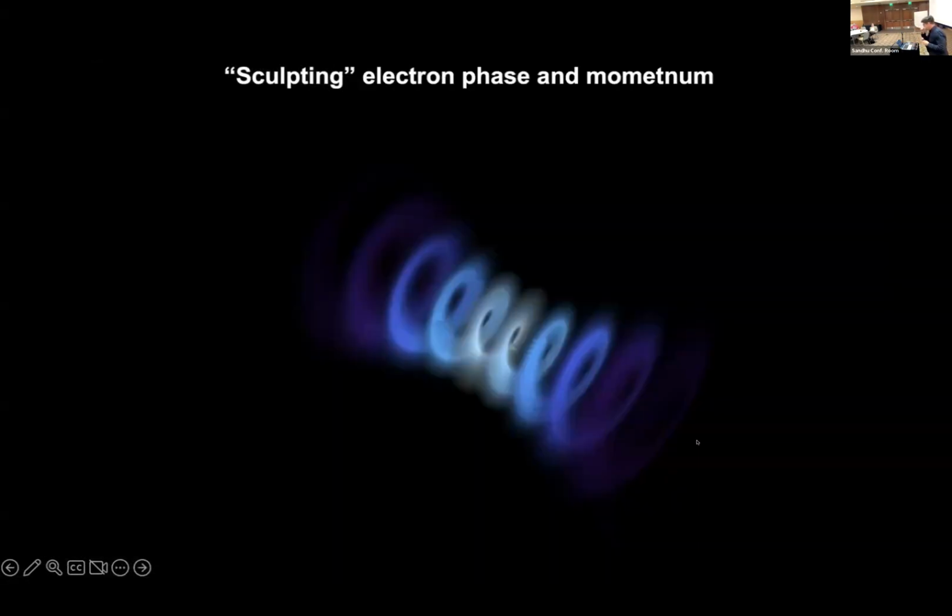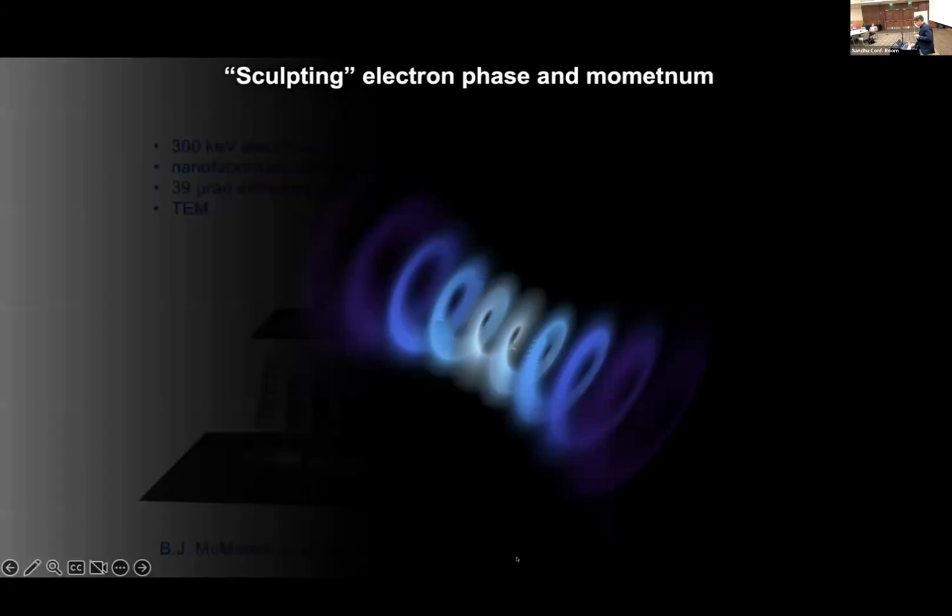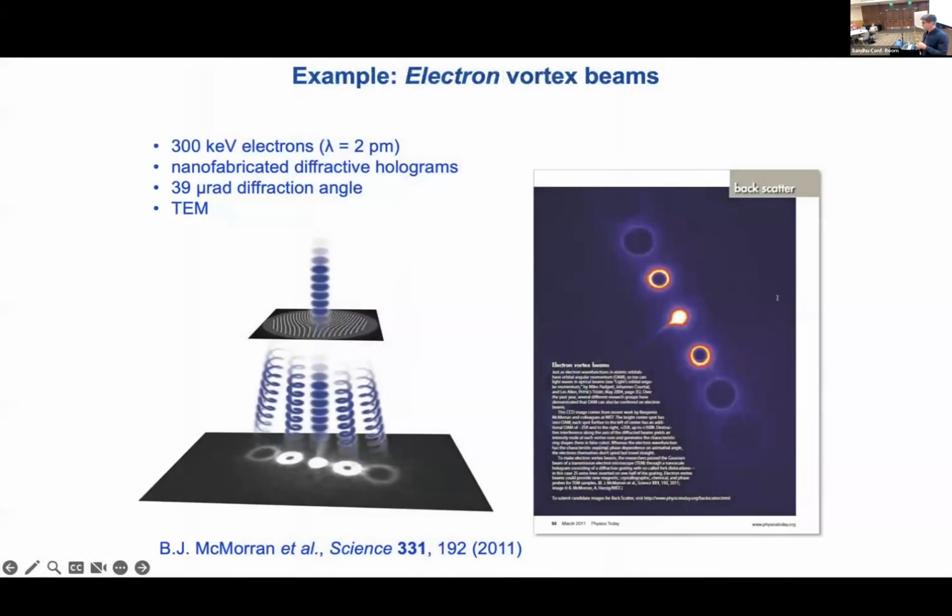Okay, so shifting gears, a new technology that a bunch of different groups have developed is the ability to coherently manipulate free electrons. So both in time and in space, you sculpt the electron phase and the momentum, which is a new word, I just see that. Okay, so as an example, there's these vortex beams, these free electrons that can carry orbital angular momentum. That's just one kind of arbitrary example.